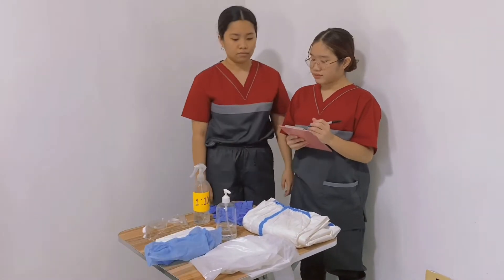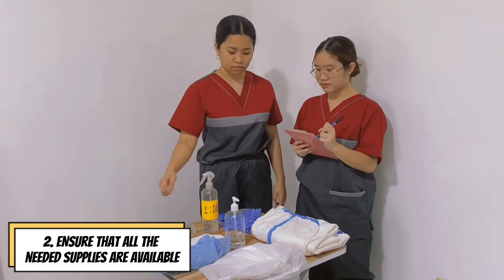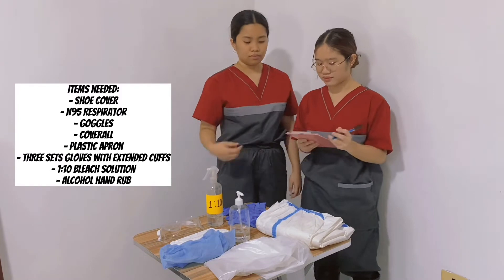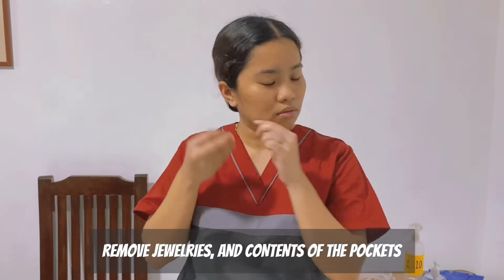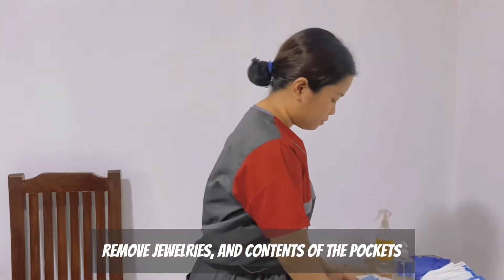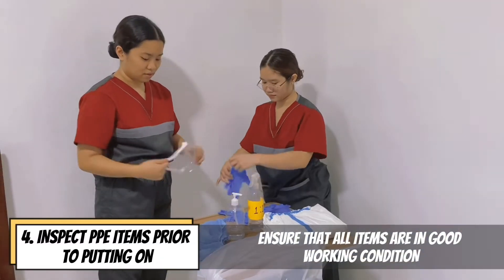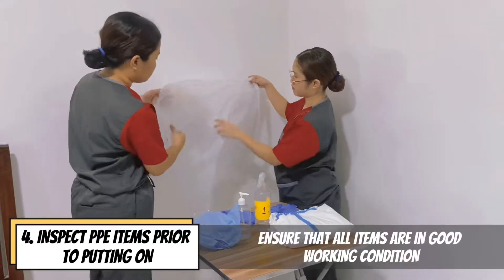Ensure that a trained observer is available to verify compliance with all the steps. Prepare so that all the new supplies are available. Prepare for the donning of PPE. Remove jewelry and contents of the pocket. Secure the hair. Inspect PPE items prior to putting on and ensure that all items are in good working condition.